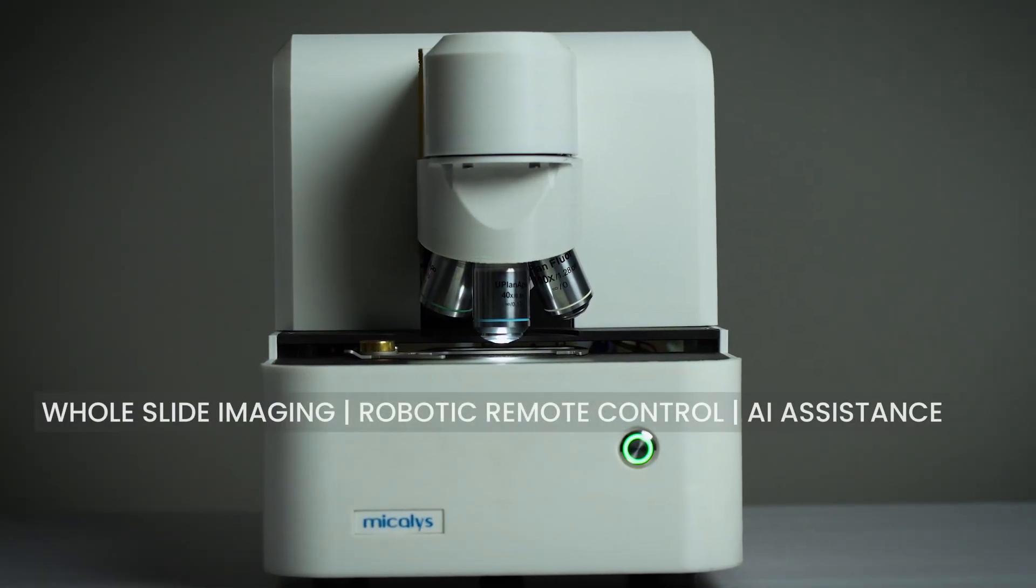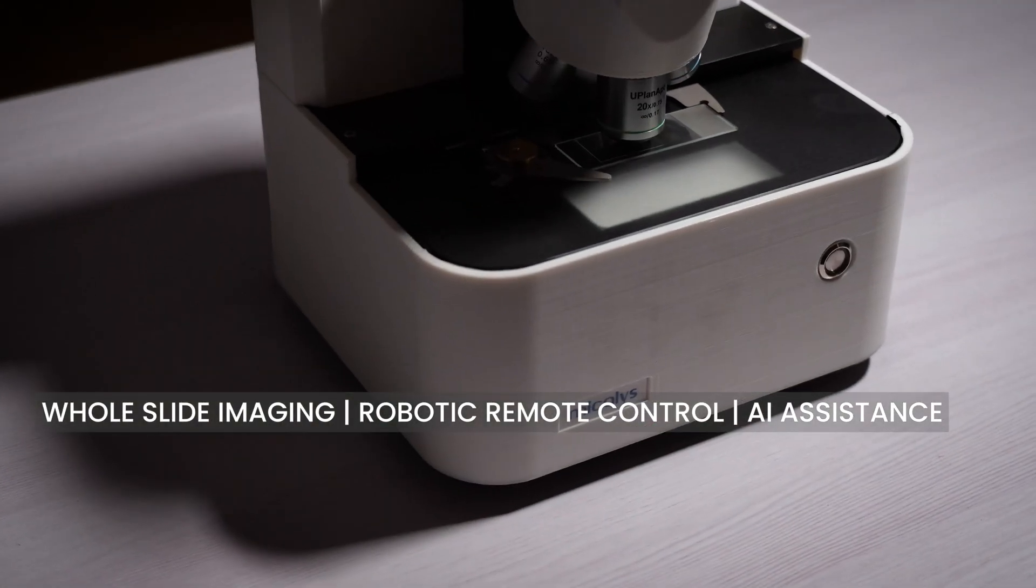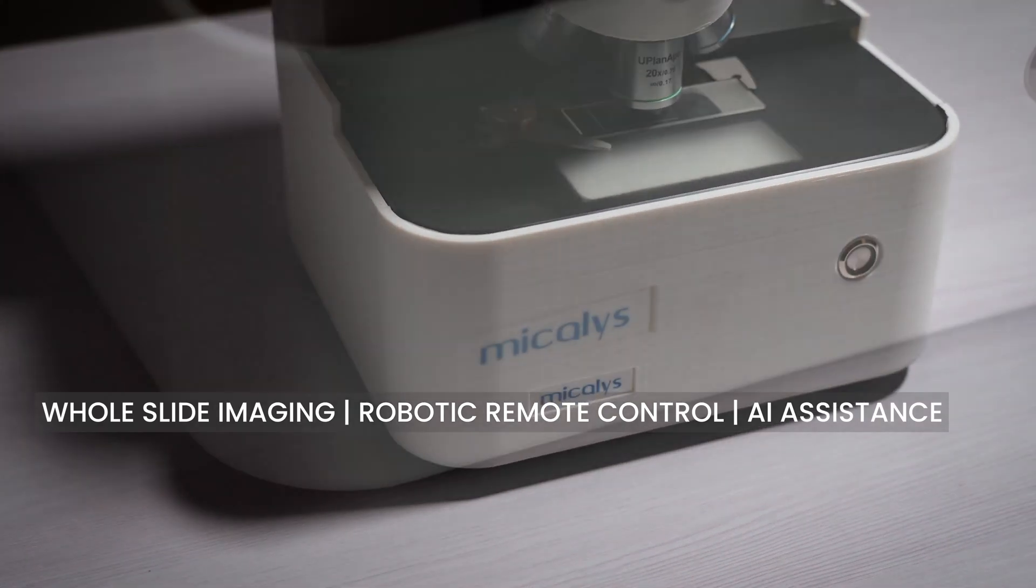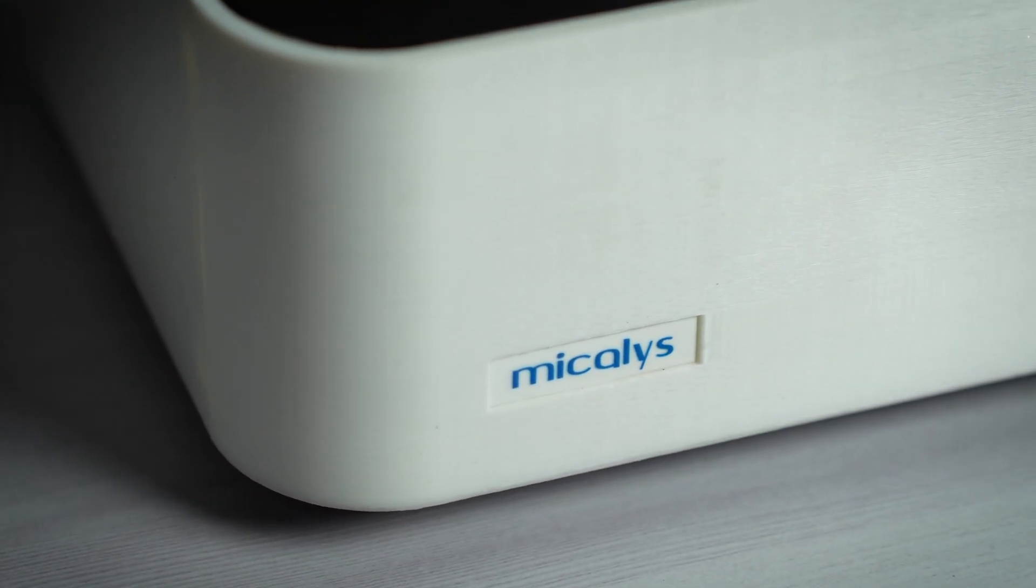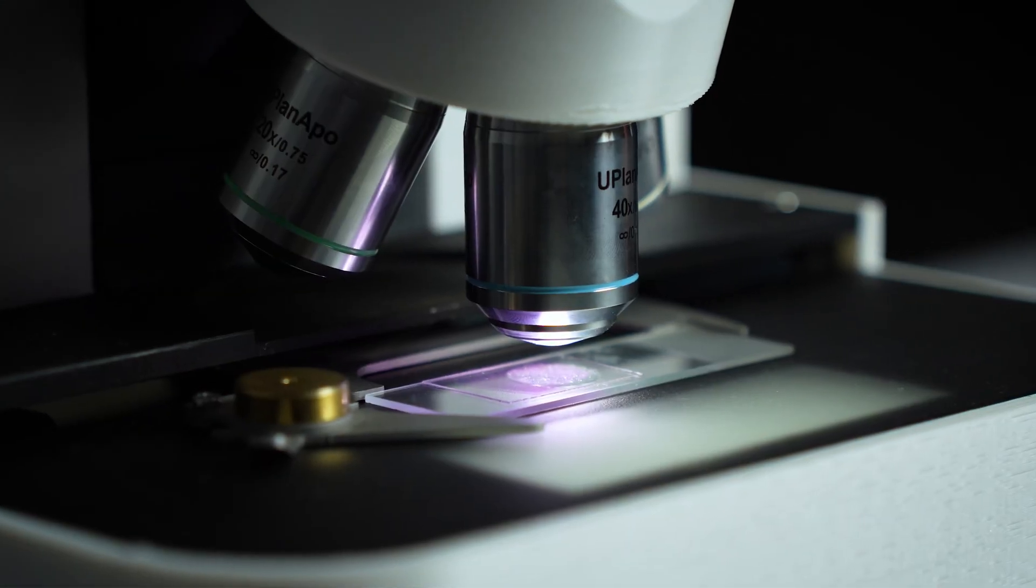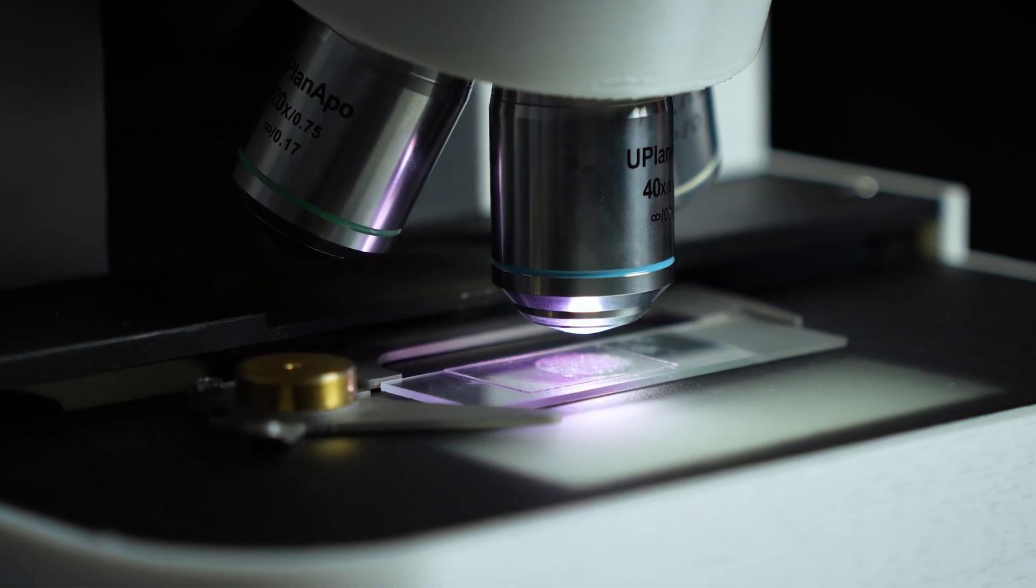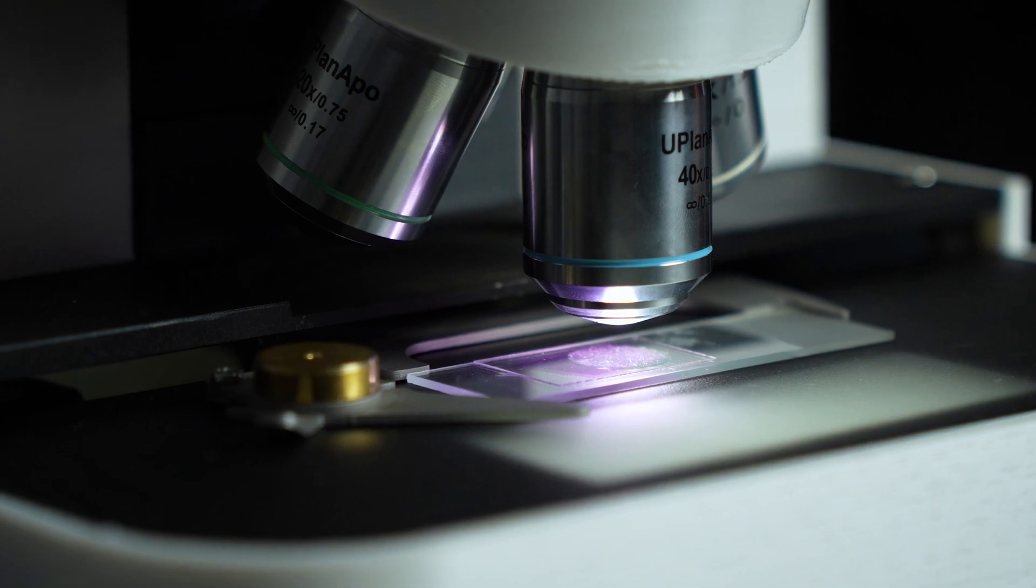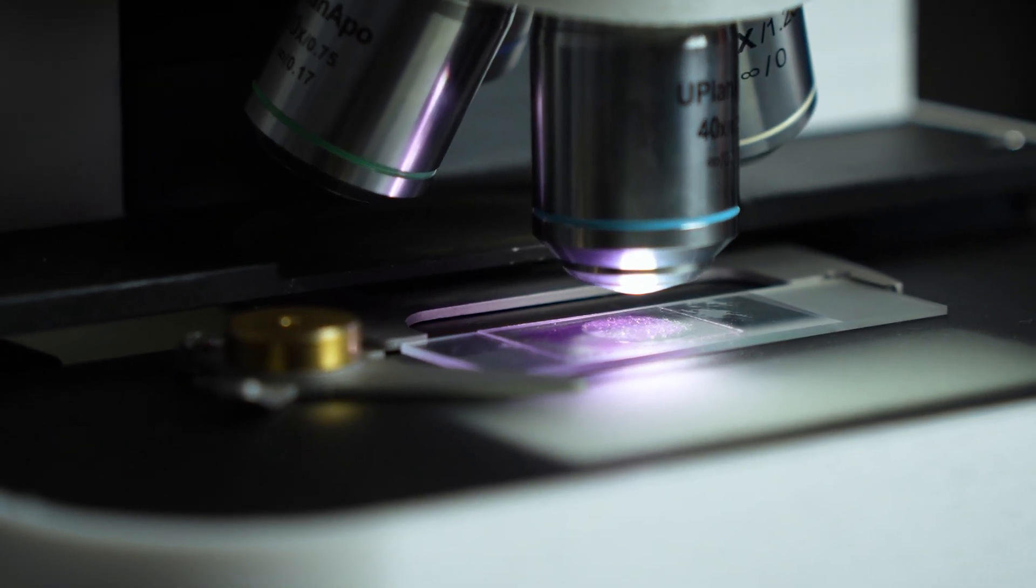Meet Micalys, the revolutionary multifunctional microscopy platform from MedPrime Technologies. Micalys empowers you to explore every facet of microscopy with its unique design and unmatched features.